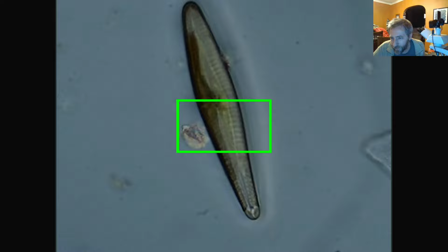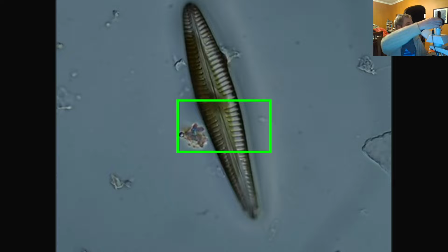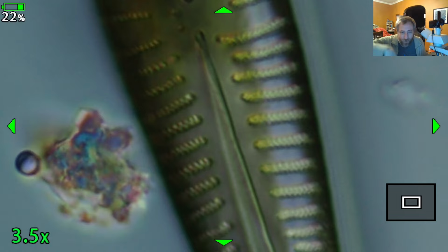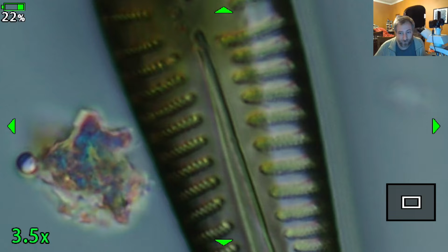Let's see. So, what are striae? Striae, that's just Latin, it means stripes. So the little lines that you see going across this diatom are striae. If I zoom in on the striae for these, you can see that they're made of alternating rows, what we call biseriate striae, of little holes. You can't actually see the holes, so trust me, on a scanning electron microscope you would see them. There's a big wide band running through the middle. That's the raphe, and the little things coming in from the sides that look like little fingers coming around the edges, those are the striae. Stria is one, striae is multiple, so it's just a bunch of lines, basically.